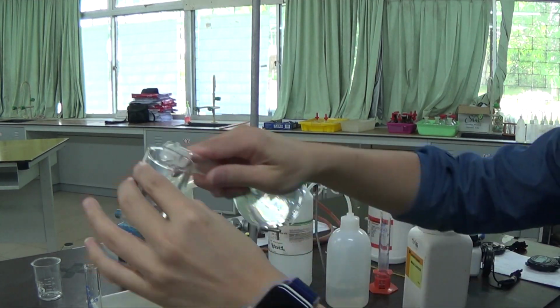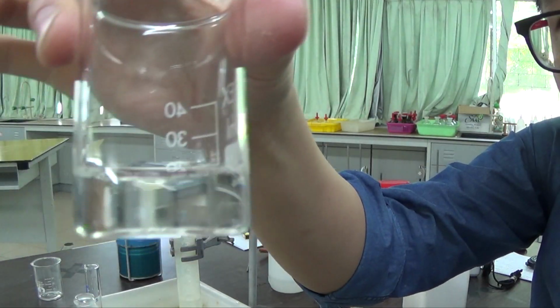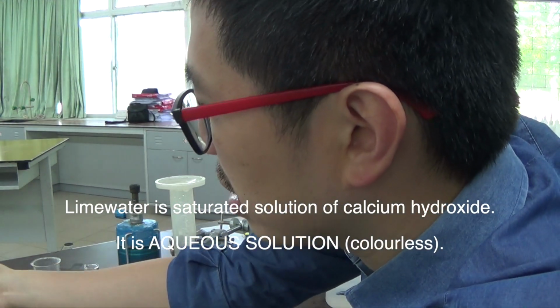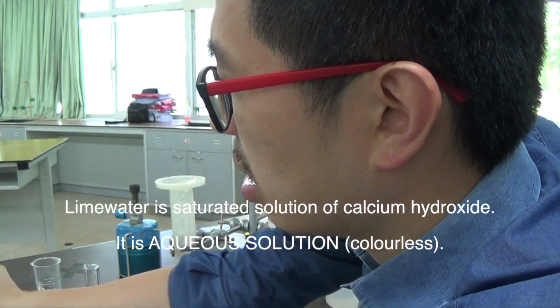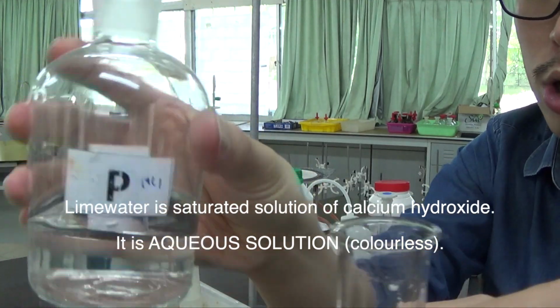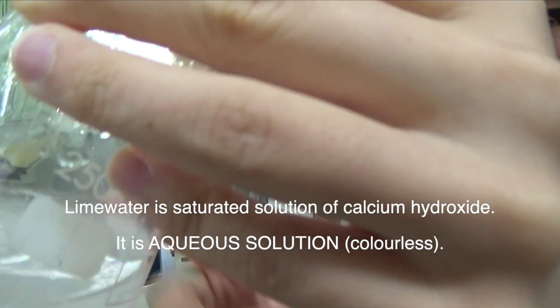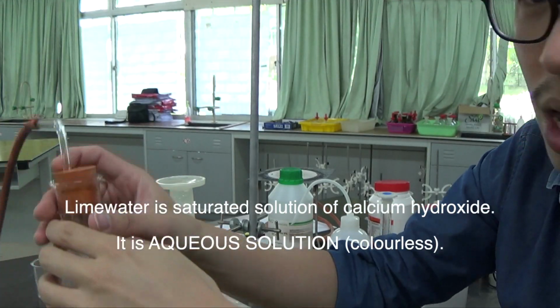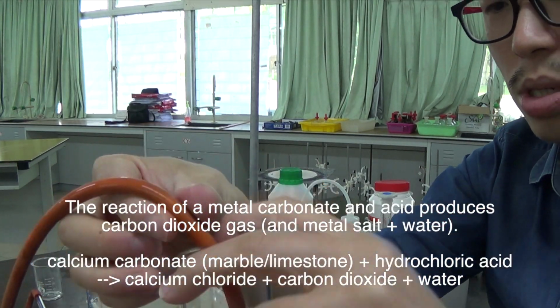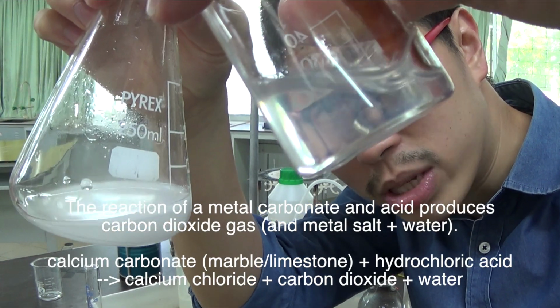I have lime water in there. So this is just my lime water, it's a colorless solution. I will put some more acid into here. Remember just now this was the remaining carbonate. I put in some more hydrochloric acid. Do I get any reactions? I still see bubbles, so there is still gas being produced. I close it up. The gas that's being produced is basically carbon dioxide.